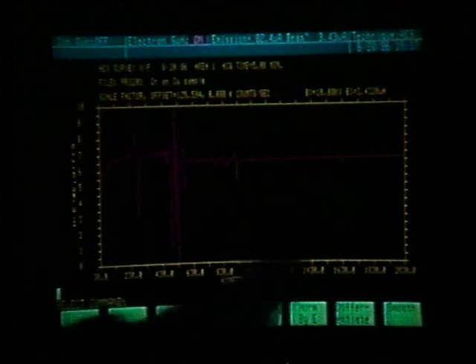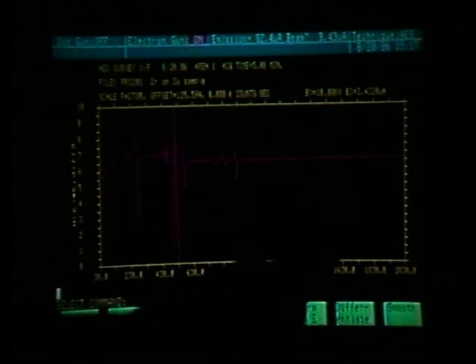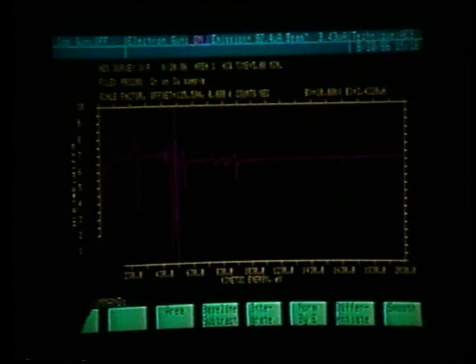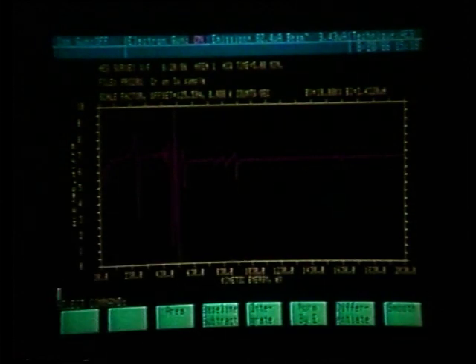These things we need to determine before we set up for the profile. That's why it's good to take a survey scan, evaluate what is present, and also the amounts of what is present, and also think ahead as we sputter into the sample that carbon will decrease, oxygen will probably decrease, copper, being the substrate, is sure to increase.